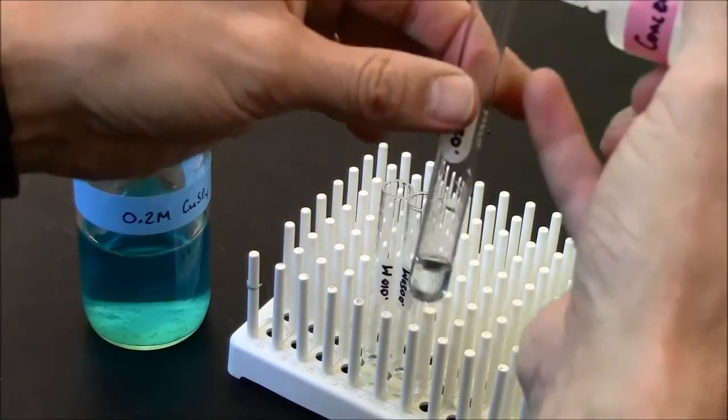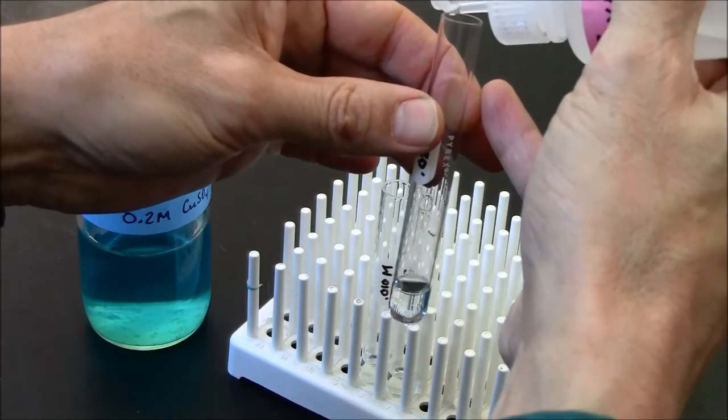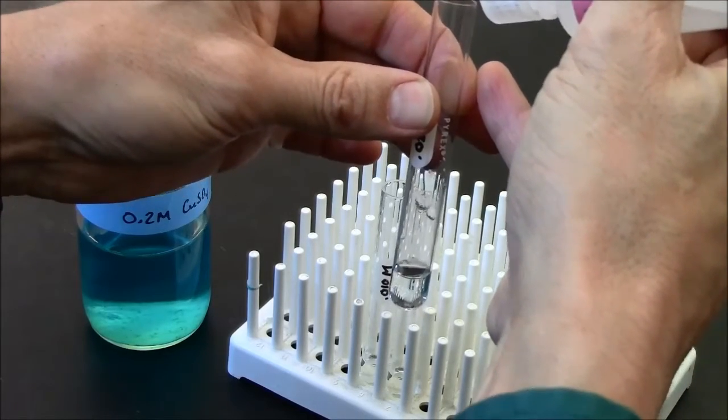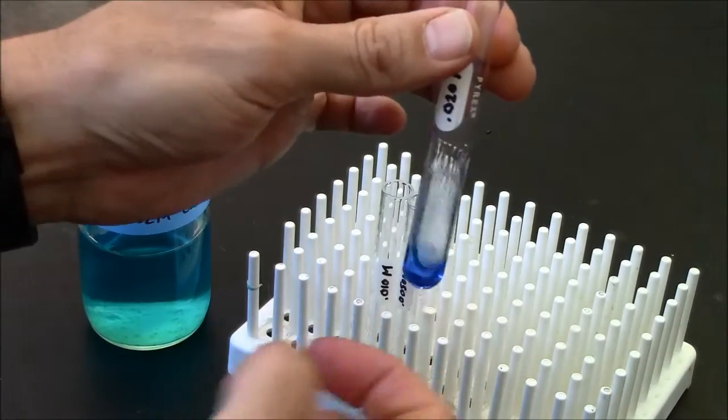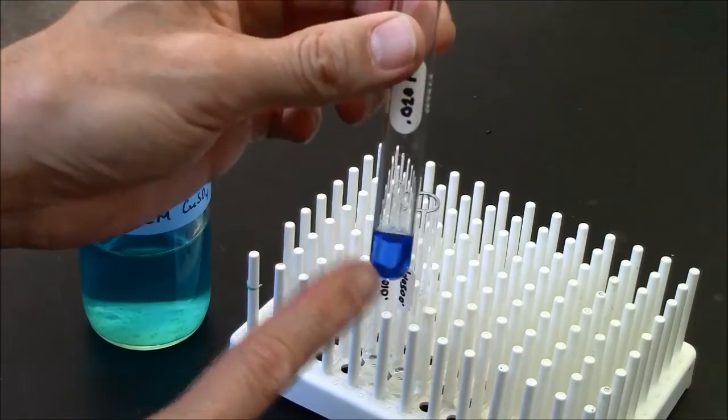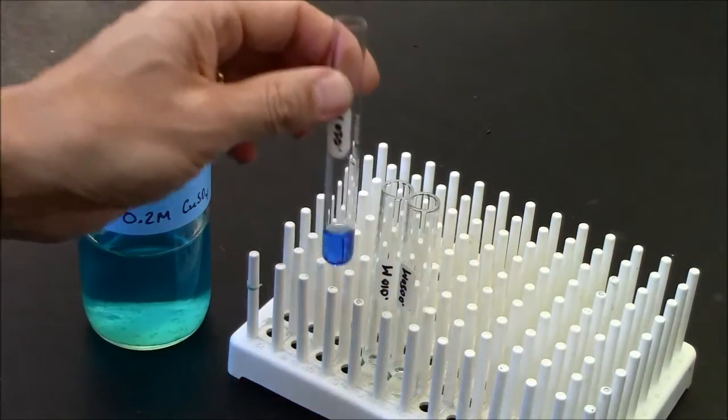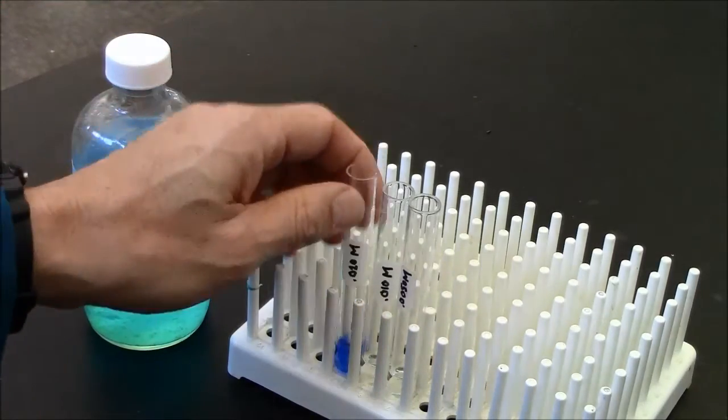So here I'll add five drops of the concentrated ammonia. One, two, three, four, five. And as I stir this, you can see a very vibrant blue color appears, and the intensity of this color is proportional to the concentration of the copper ions. So that happened to be 0.020 molar.